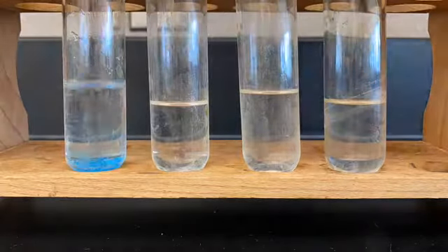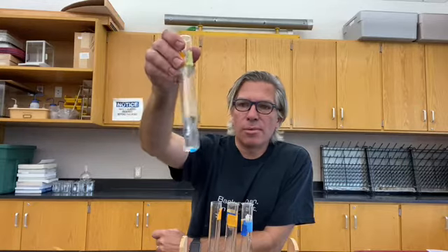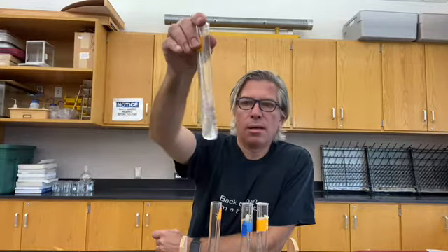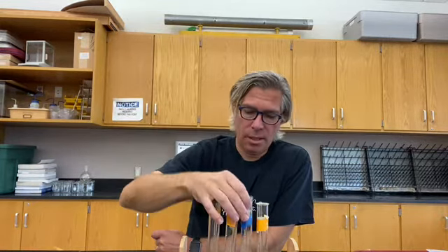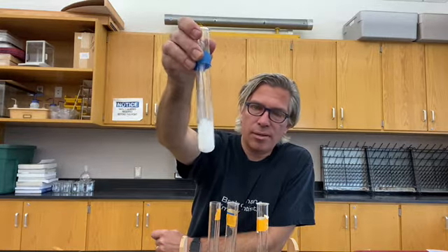Now for the ethanol test. In the ethanol, the copper sulfate did not dissolve. The paraffin did not dissolve. Zinc, still nothing. The dextrose, on the other hand, has partially dissolved and is clouding up the solution.